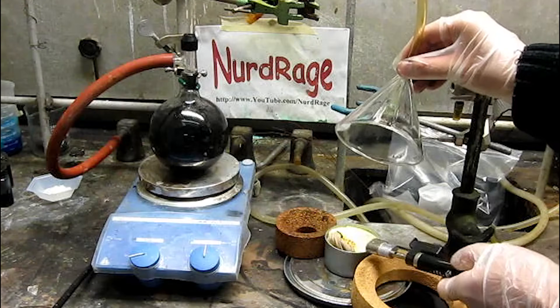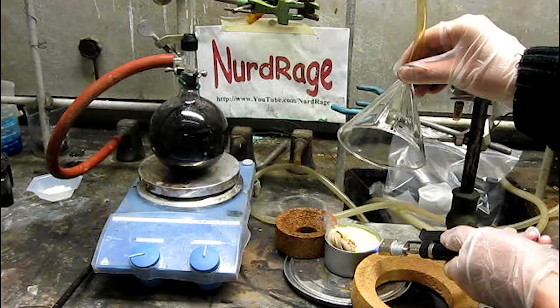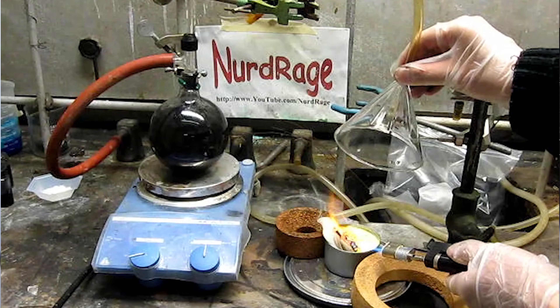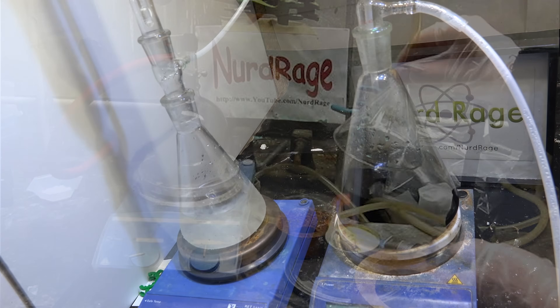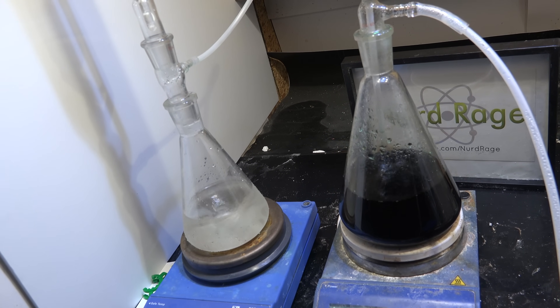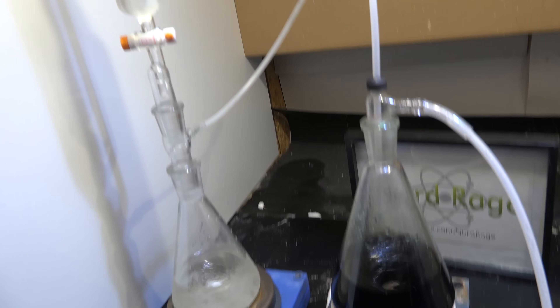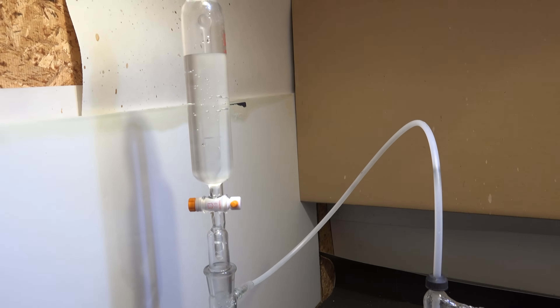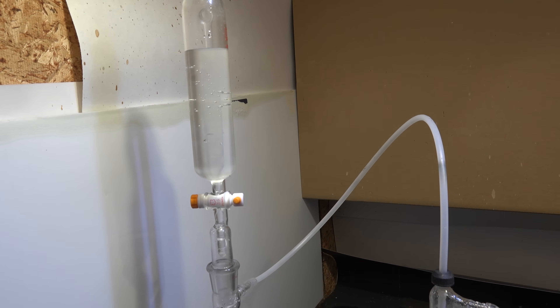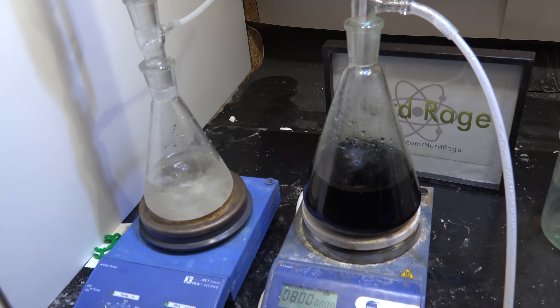Now we need a source of sulfur dioxide gas. The most efficient way to make it is to burn sulfur and pump the sulfur dioxide gas into the reaction. I'm instead going to use a sulfur dioxide generator that uses a solution of sodium metabisulfite with dripping hydrochloric acid. This is overall a more expensive way of making sulfur dioxide, but I'm using it because it's more convenient. You can burn elemental sulfur instead.